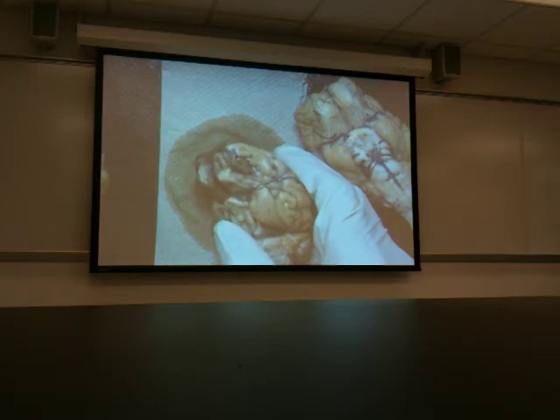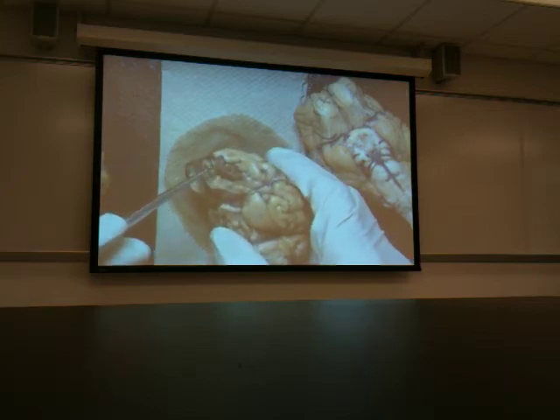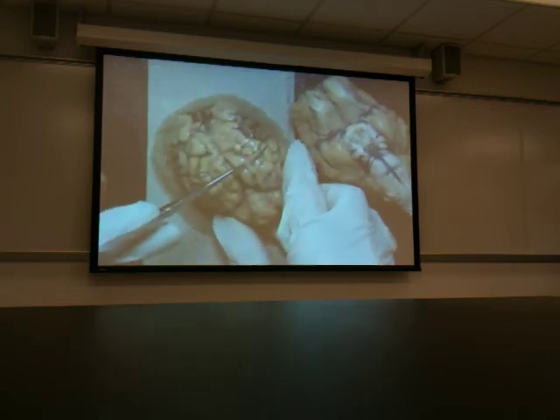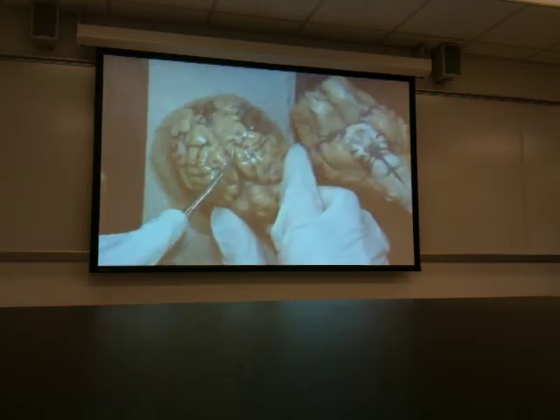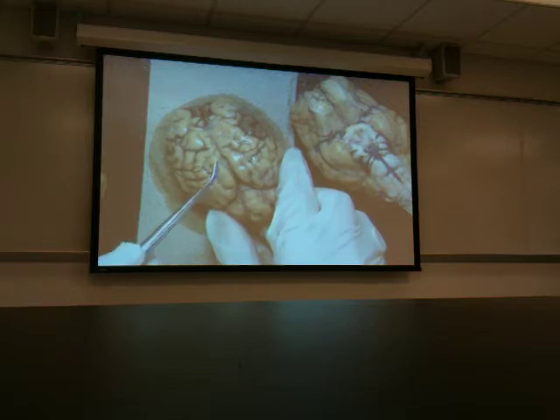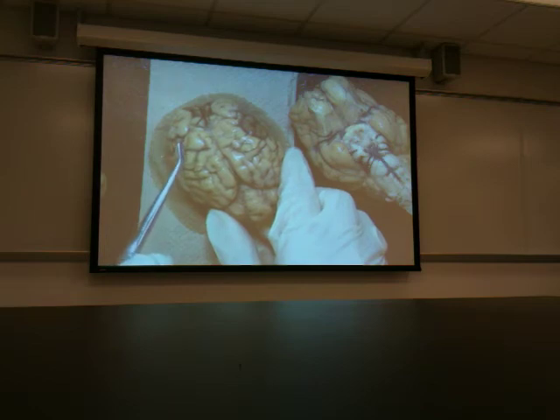Okay. Now that is arachnoid right there, but so too is this glistening surface. Do you see that? That glistening, I could push on that, and I could literally see fluid movement underneath. It's like somebody put cellophane on this brain. That is arachnoid. Now that is covered by the dura mater. Each of these are meninges. Don't dare confuse mater, M-A-T-E-R, Latin for mother, with matter, M-A-T-T-E-R, white and gray.